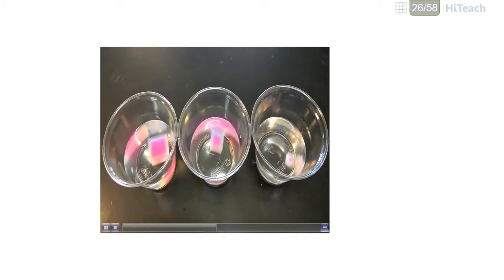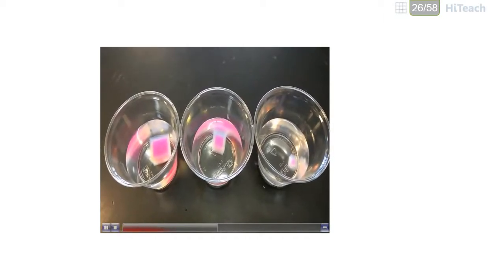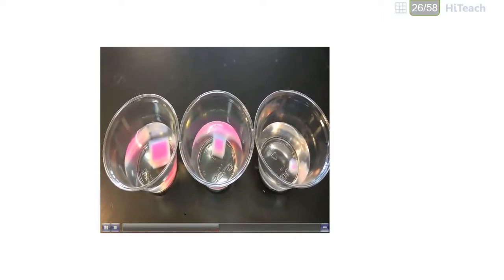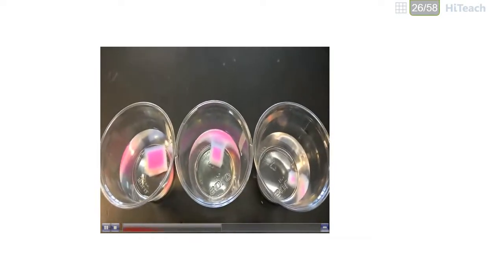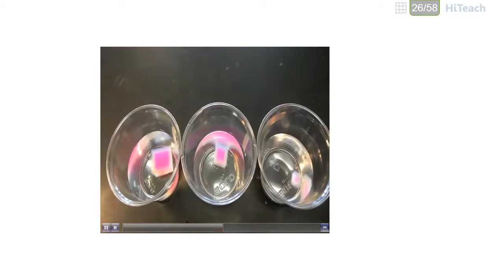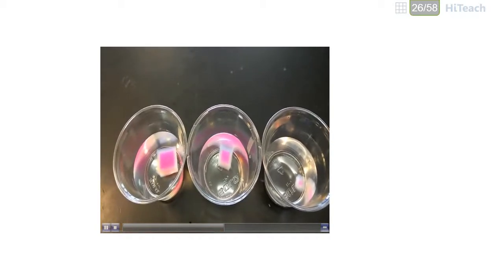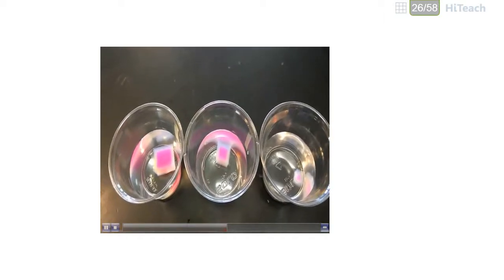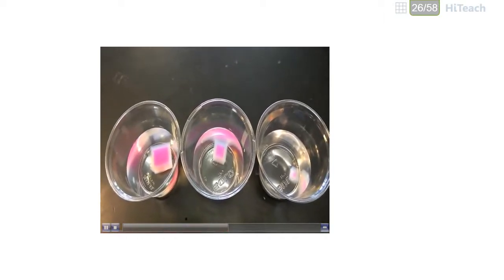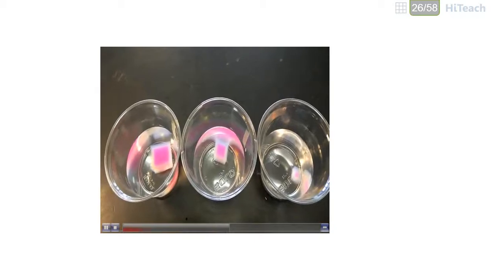At about 5 minutes into the experiment, you can see that in the smaller cube the acid has almost diffused completely through, whereas in the medium cube it's about a quarter of the way through, and in the large cube the acid has diffused very little. So this lab demonstrates why cells are small.